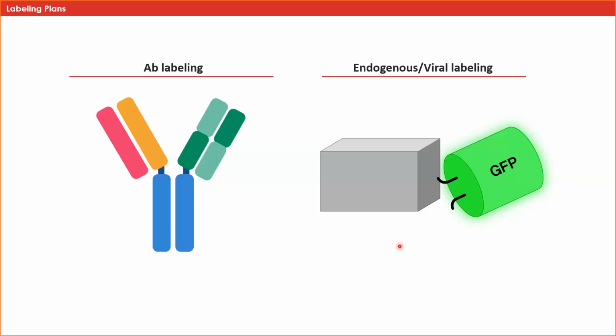For samples that will be antibody labeled, we recommend that you overall limit the size of your tissue sections. Antibody labeling can take a considerable amount of time and significantly stretch your consumable budget. For example, with a whole mouse brain, labeling can take up to 4 weeks per antibody. Other organs would take even longer, during which time you may experience some degradation of tissues, and even with a high concentration of antibody, the distribution of labeling through the entire sample may not be even.